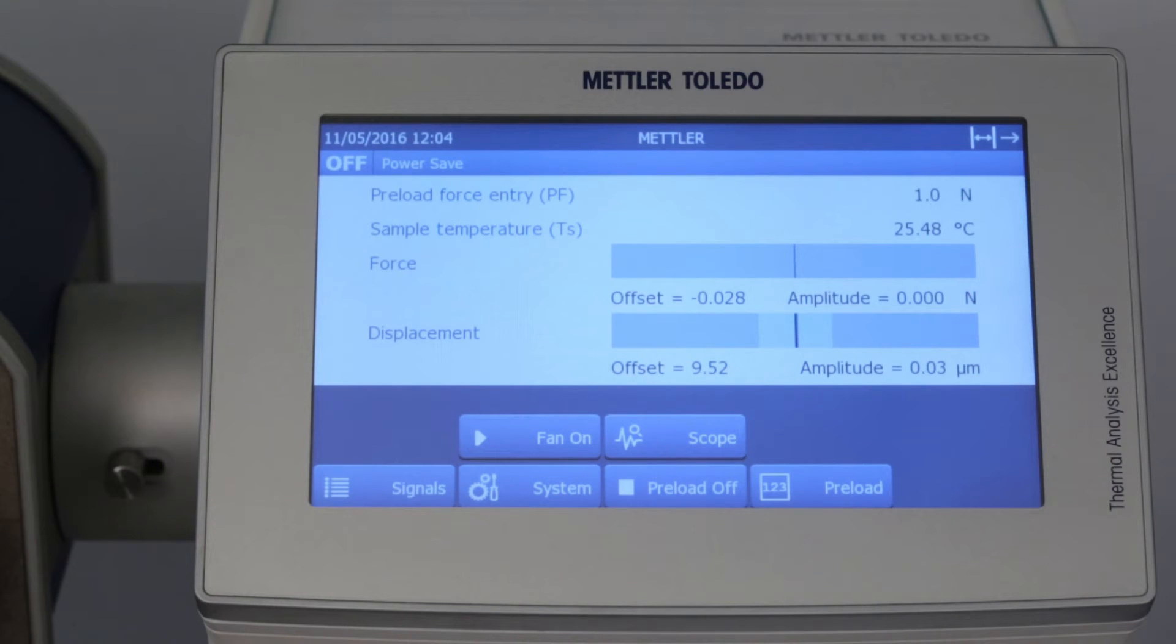By default, the preload force is 1 newton. If this is too small or too large for your sample, you can change it on the preparation screen.